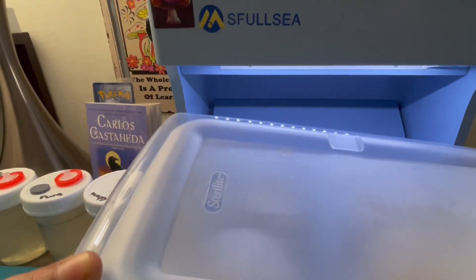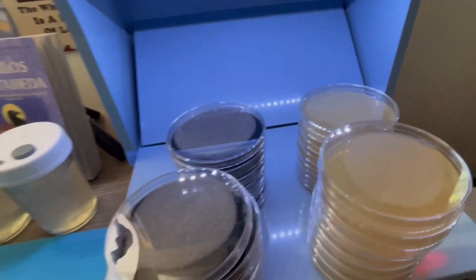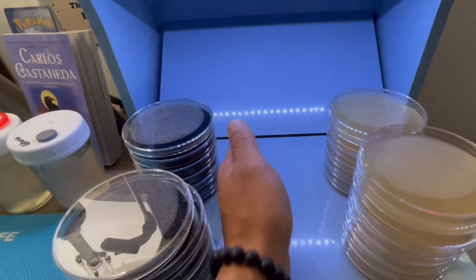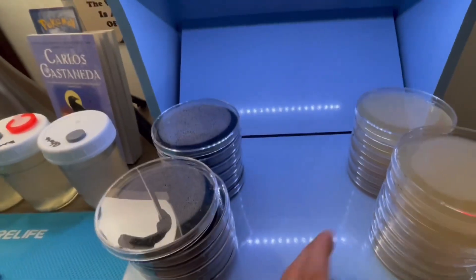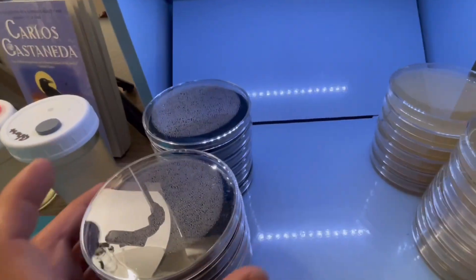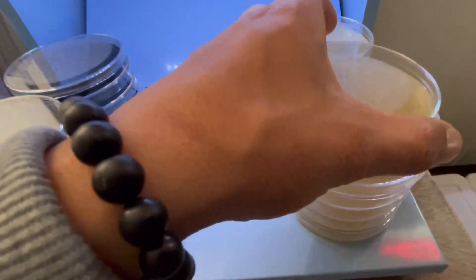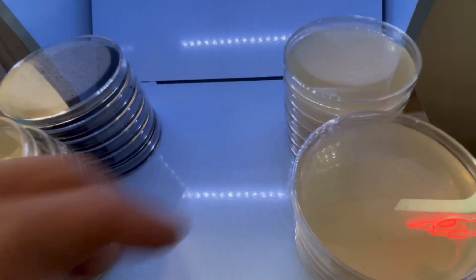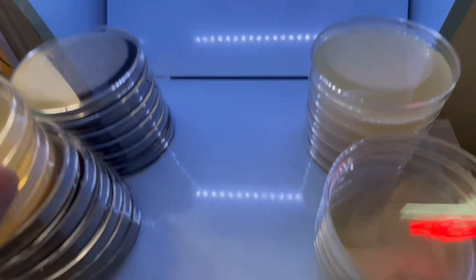I've done about 200 plates — I just did these petri dishes, poured them in front of the flow hood. You can fit about 25 petri dishes, a full sleeve, without any issues. You can just stack them right there, then pour, do your transfers — pretty much work here pretty comfortably.